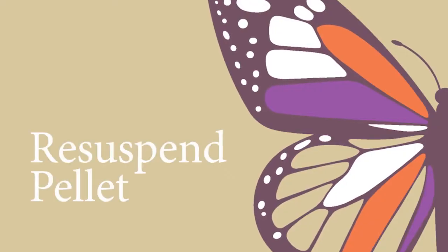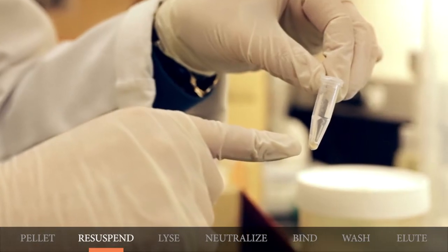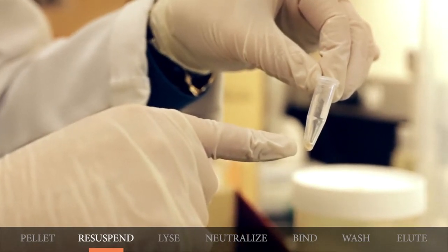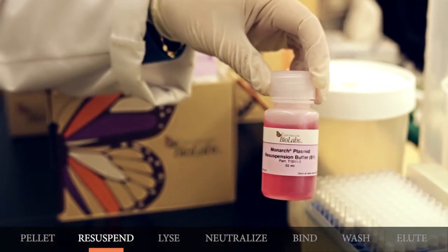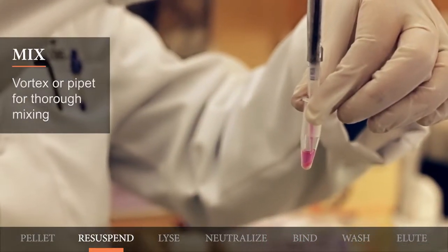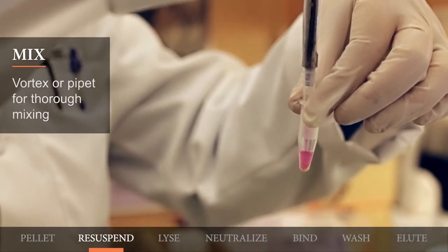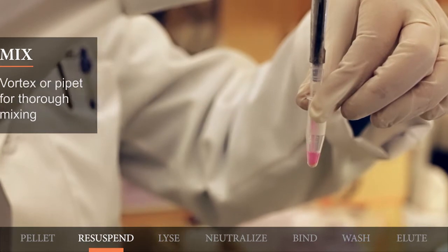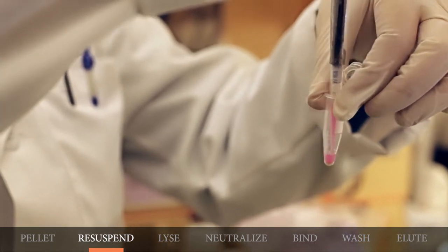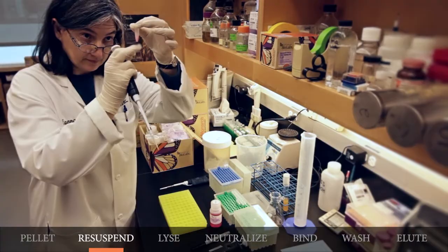The next step will be the resuspension step. Resuspend the bacterial pellet in 200 microliters of the plasmid resuspension buffer B1. You can vortex the tube or pipette up and down to ensure that the cells are completely resuspended. It is important to resuspend the cells completely in order to achieve complete lysis in the following step.